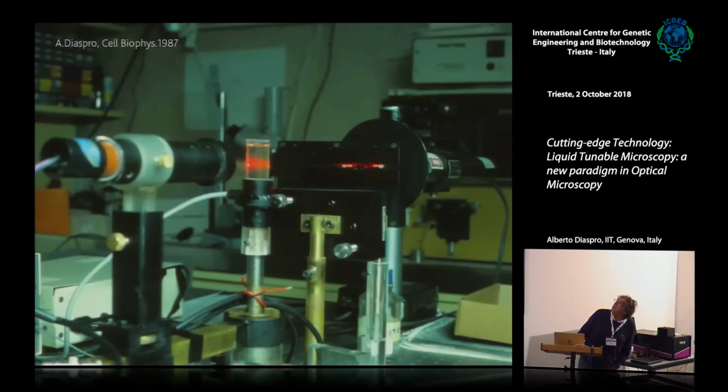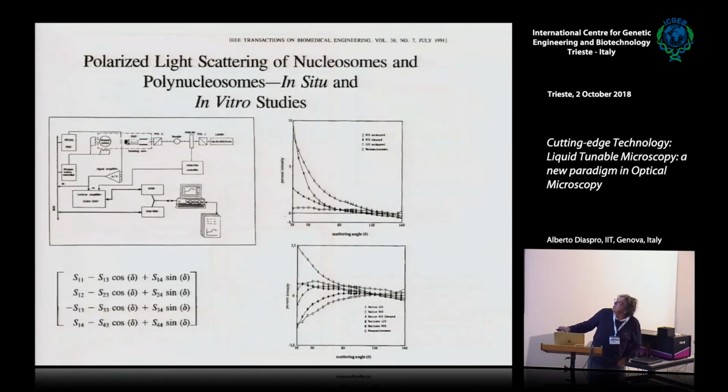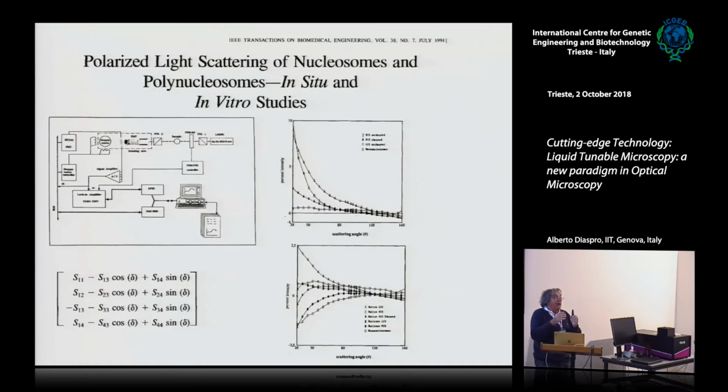We decided to set up an instrument. Sorry for being fast here, I want to reach another point. And we decided that we wanted to use in the 90s this differential information for detecting different ways chromatin is organized, in that case in solution. Changing the ionic strength, we had the chromatin in a different organization, extracting chromatin in different ways. So with potting or cold water swelling, we had different organizational motifs.